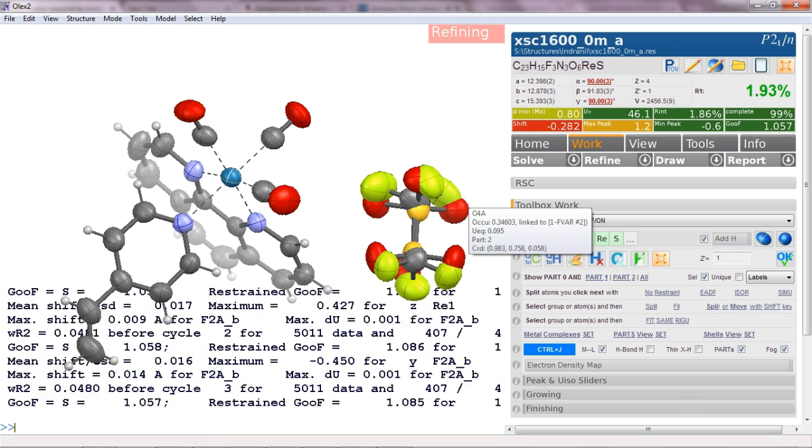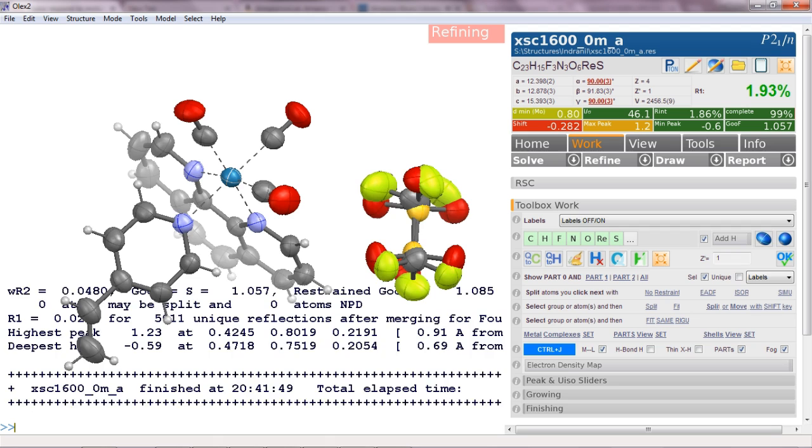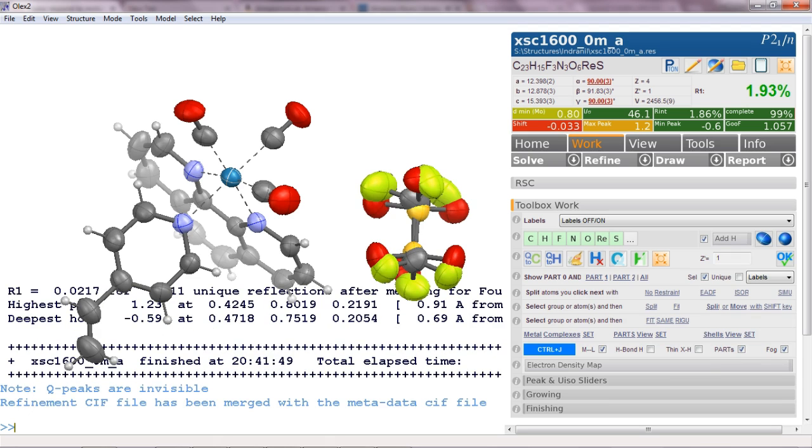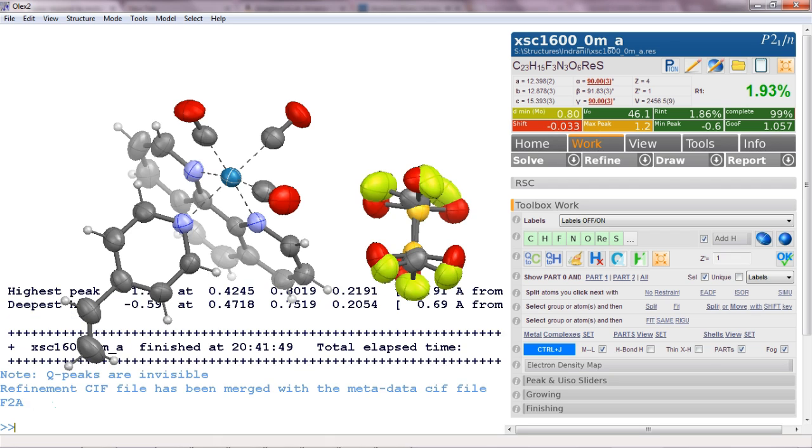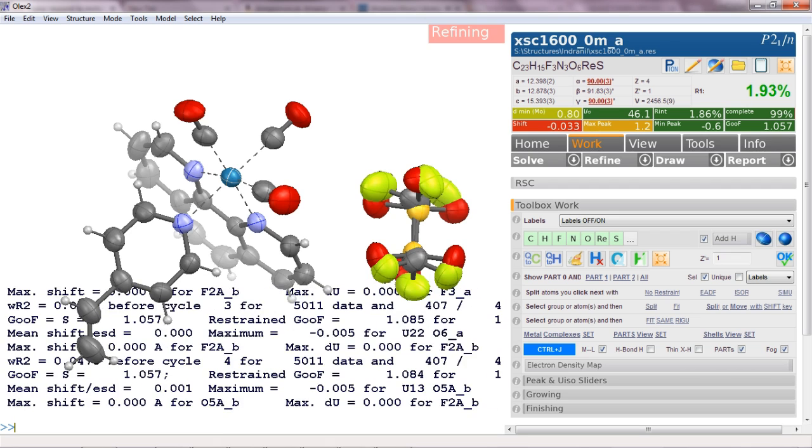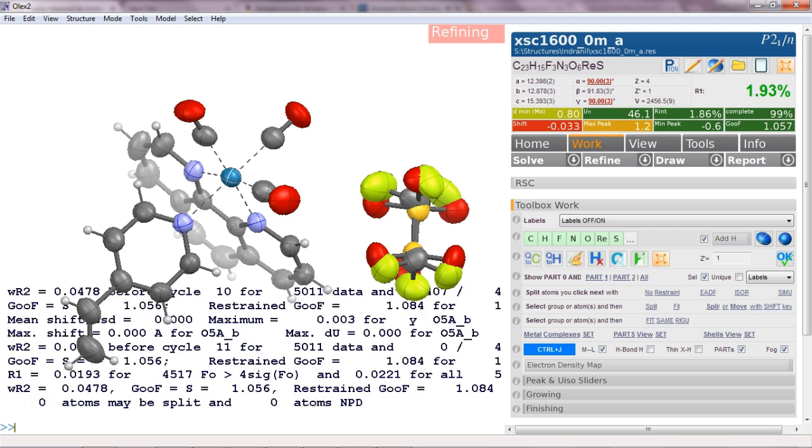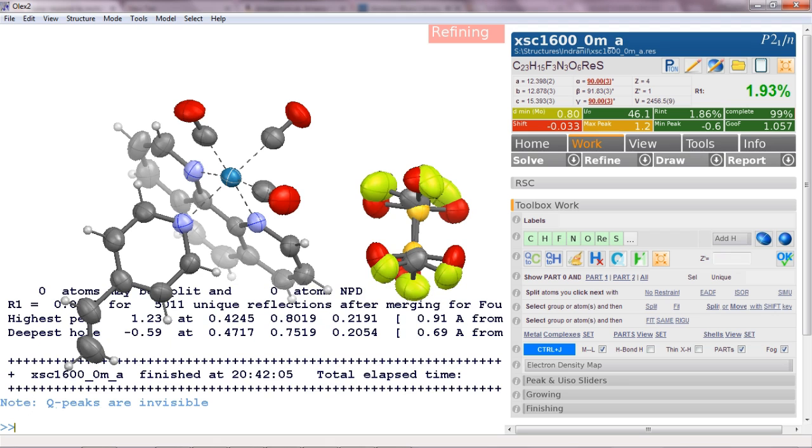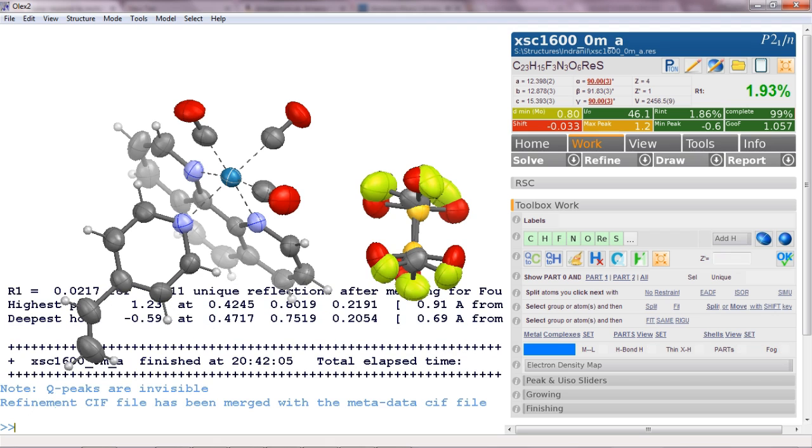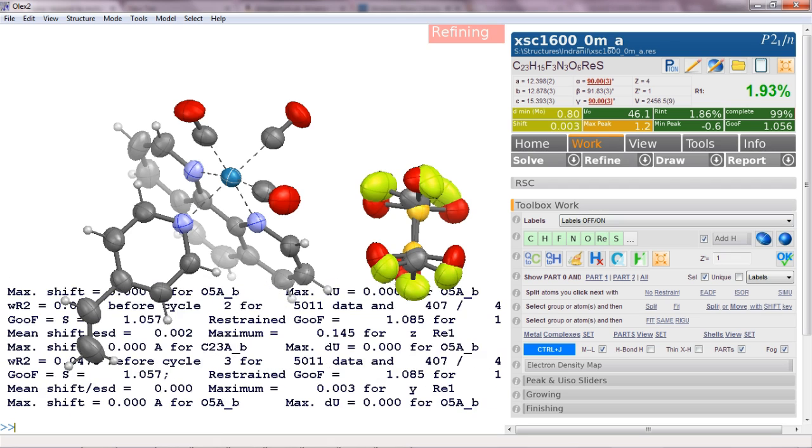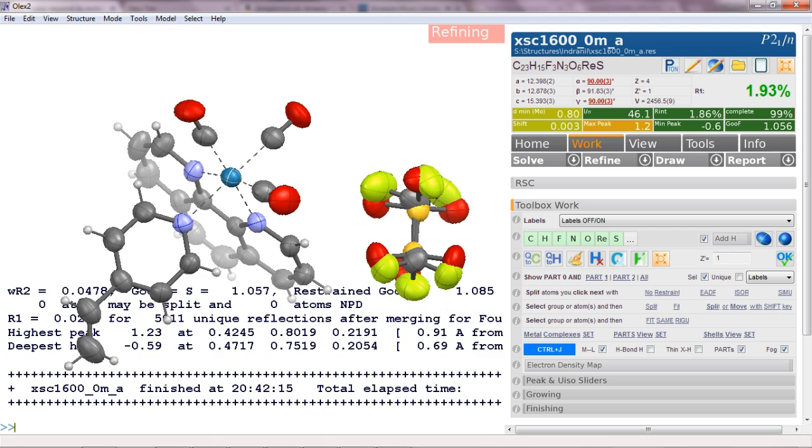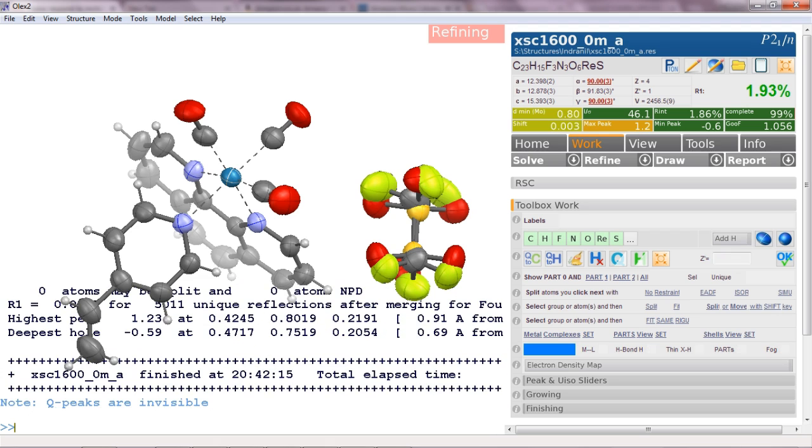And refine it again. And there we go. It's settling nicely. It's converging quite slowly. Let's see what's moving here, it's those ones. So if that wouldn't settle, and I suspect it probably will, then we probably need a slightly stronger REGU here. But at the moment, I think if we do a few more cycles, it probably will settle to a reasonable value here to zero. There we go. More or less one more time, for good measure. And then let's examine what we've got before we declare it finished.